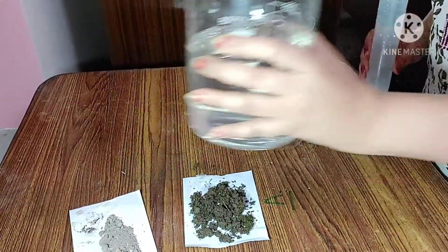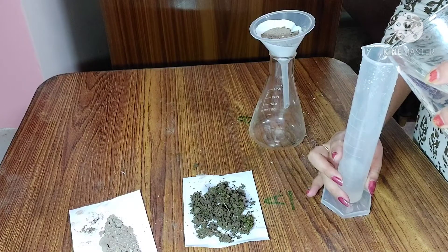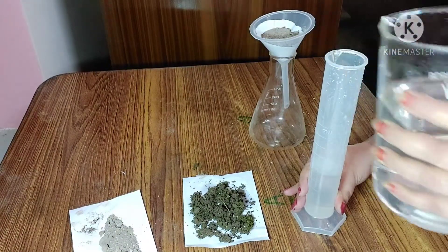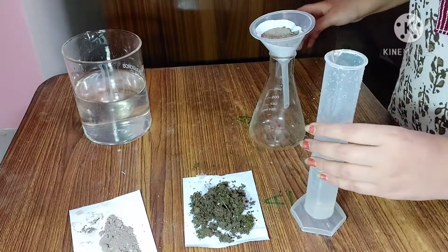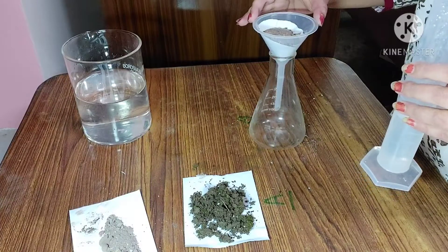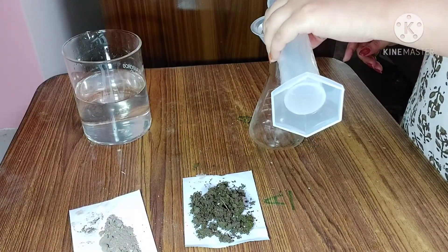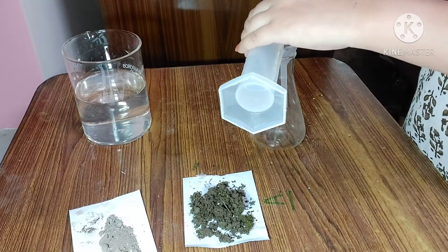After that, I will take 50 ml of water in the measuring cylinder and add 50 ml of water into the soil — slowly. This step should be done very slowly.